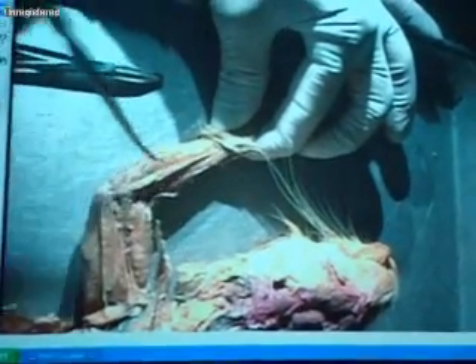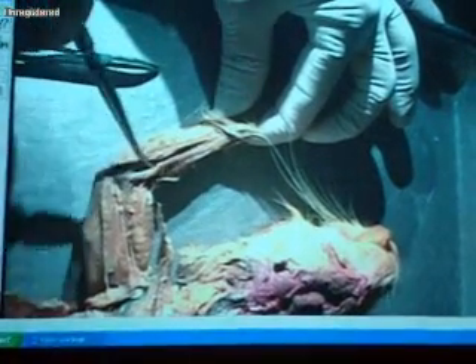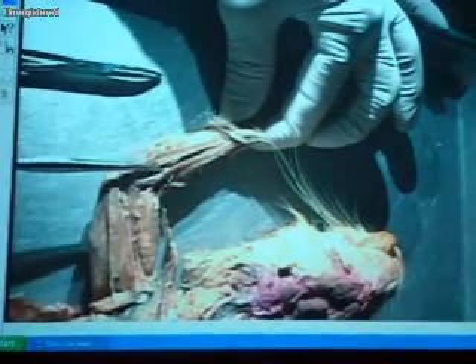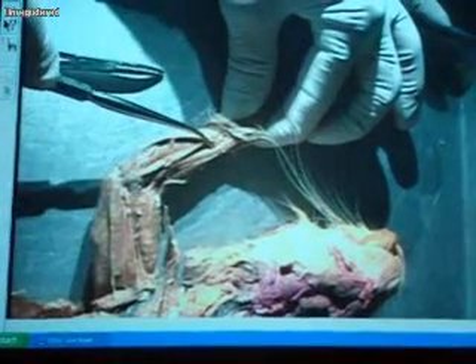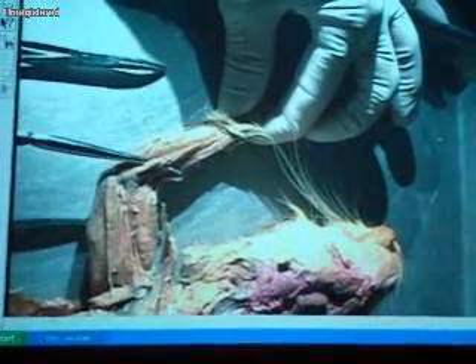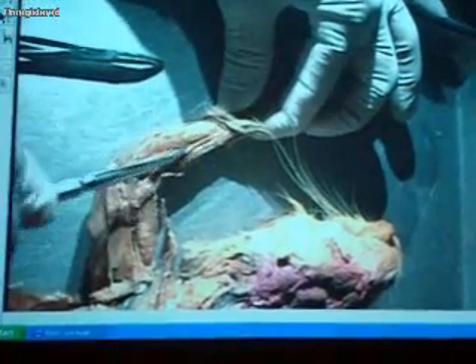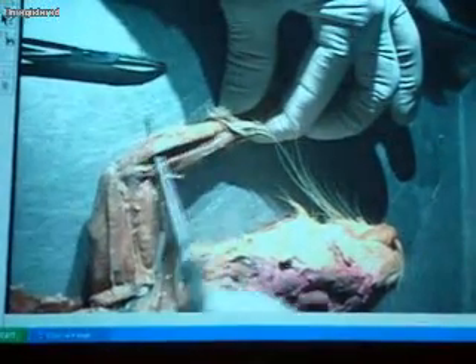This is flexor carpi radialis. Pronator teres is this little skinny one — you can actually pull the muscles apart. You can see it's really skinny, but it comes across the bone and inserts right here into the radius. The next one is flexor carpi radialis.